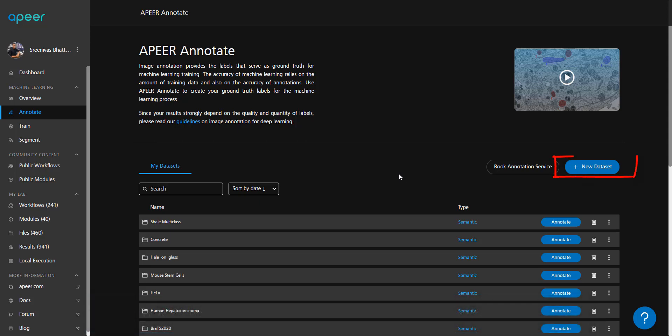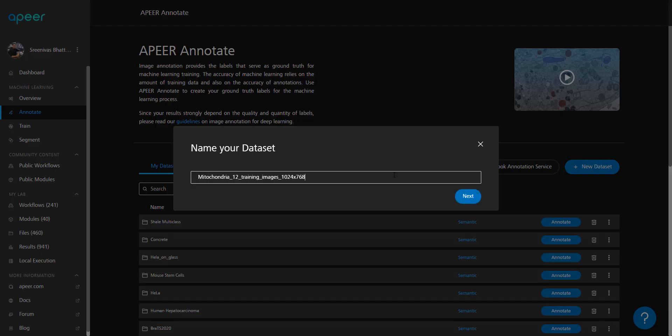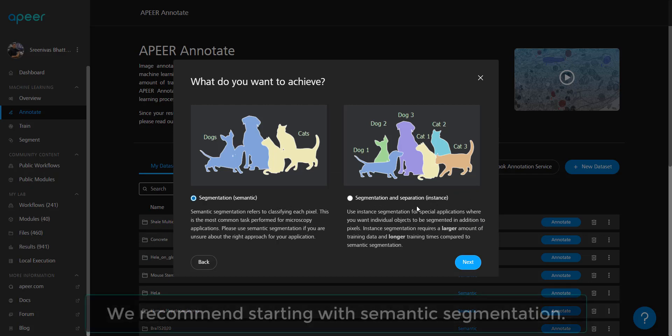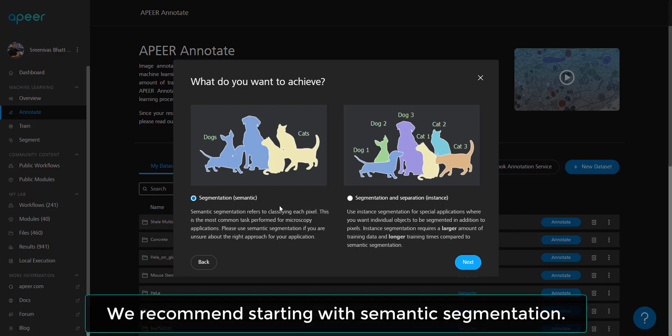To get started with annotations, please start by creating a new dataset. Give an appropriate name and hit next. Here you can select between semantic or instance segmentation. Semantic is where every pixel is segmented, and instance is where every pixel is segmented and also every object is separated.